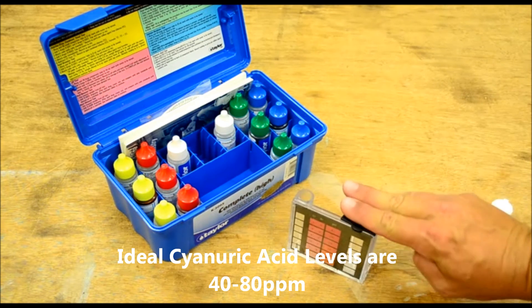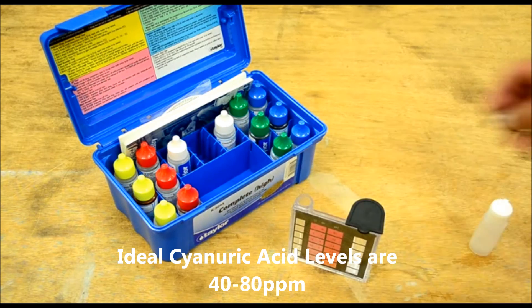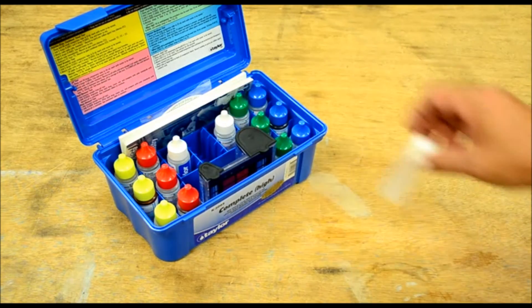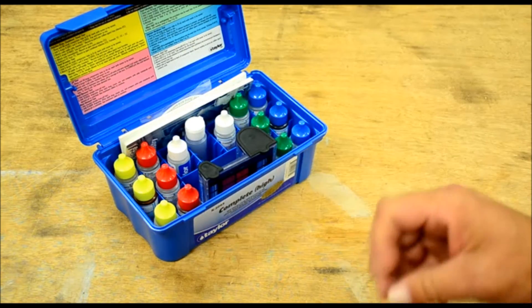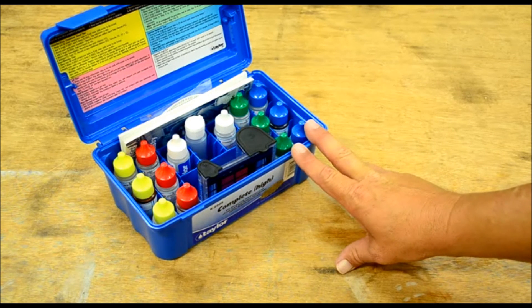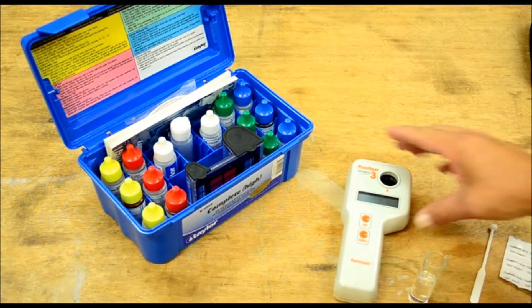That pretty much covers all your testing. As you can see in the video I've given you all the acceptable ranges. The next step is to get the digital meter out and test that cyanuric acid digitally to find out exactly where we are with that.